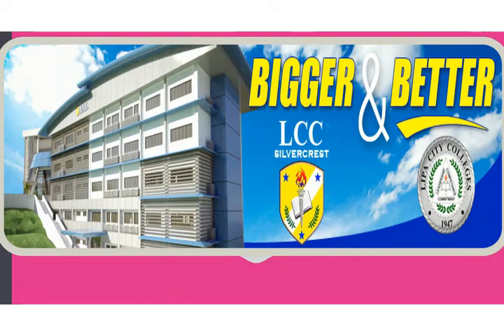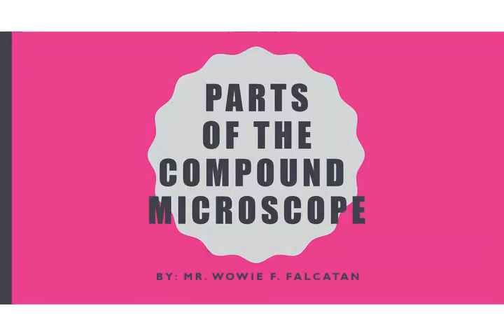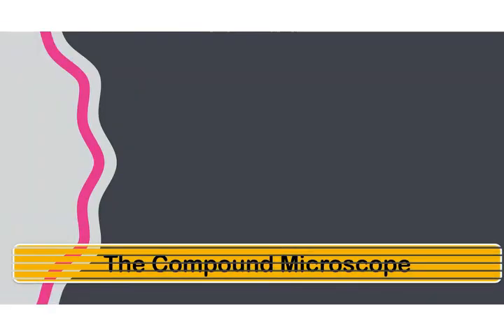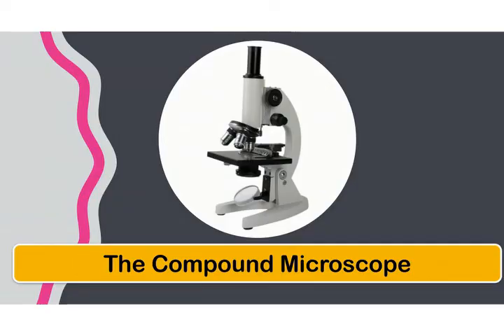Okay, so let's discuss the different parts of a compound microscope. As of today, there are many types of microscopes that can be used according to the object that needs to be seen. However, the compound microscope is the one often used in schools. Here are the parts of the compound microscope and their functions.